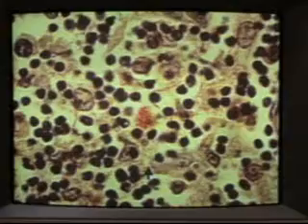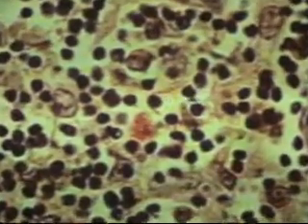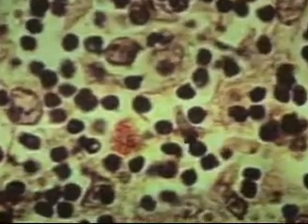So these cells do not only provide a physical barrier, but they also provide cell surface molecules which help to carry out this function, so that the antigens don't get out into the tissue. And if you look at them, it is a little easier to see the processes of these cells. Just imagine that these cells everywhere are connected to each other.